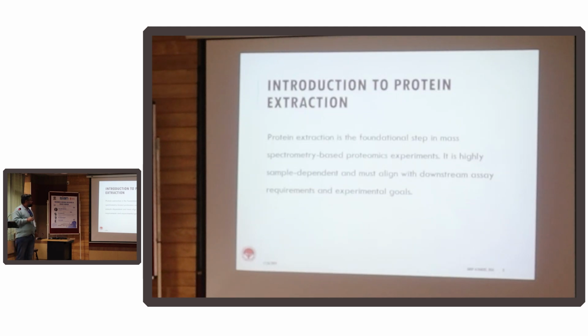Also one thing is the protein extraction. So first part is how do you extract protein, right? Protein is in the cell, right? You have to extract it, you have to take it out, and not only do you have to take it out, you have to sometimes fight with other molecules that are interacting. Suppose you want to take out histone proteins. You want to work on histone proteins. You have to fight with the DNA so that the DNA leaves the histones, and then you have to take it out.